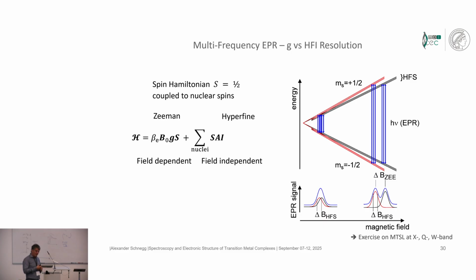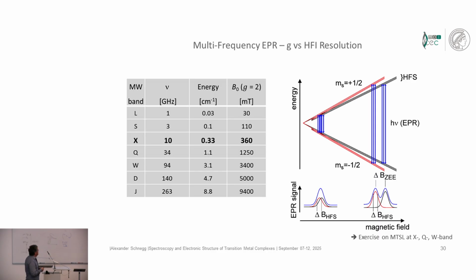This is often the case because one of the most important line broadening mechanisms we are dealing with, at least in liquid solutions, is unresolved hyperfine coupling with these zillions of protons in the environment. However, sometimes there are also field-dependent line broadenings involved, and then they destroy all of this.